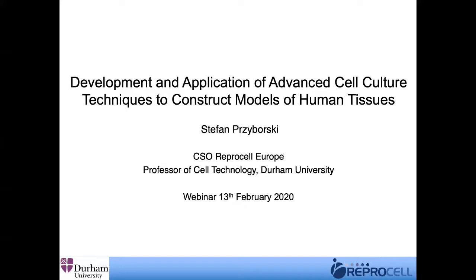So by way of overview, I will give you some background as to why, first of all, 3D cell culture is important, and then how we use 3D cell culture as a technique to engineer tissue equivalents in vitro.